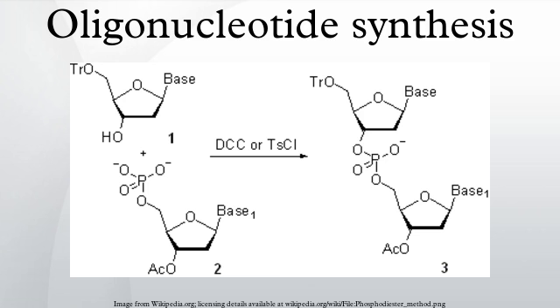Oligonucleotide phosphorothioates and their synthesis. Oligonucleotide phosphorothioates are modified oligonucleotides where one of the oxygen atoms in the phosphate moiety is replaced by sulfur. Only the phosphorothioates having sulfur at a non-bridging position as shown in the figure are widely used and are available commercially. The replacement of the non-bridging oxygen with sulfur creates a new center of chirality at phosphorus. In a simple case of a dinucleotide, this results in the formation of a diastereomeric pair of Sp and Rp dinucleoside monophosphorothioates whose structures are shown in the figure.